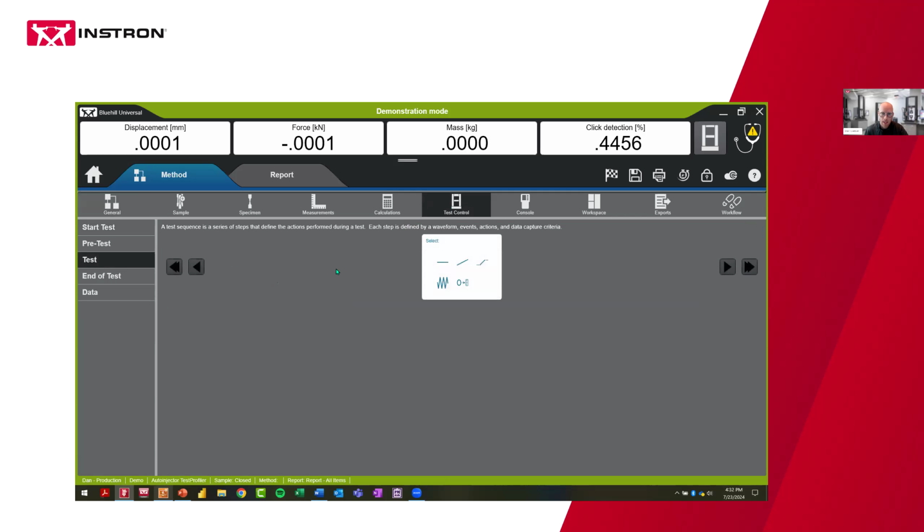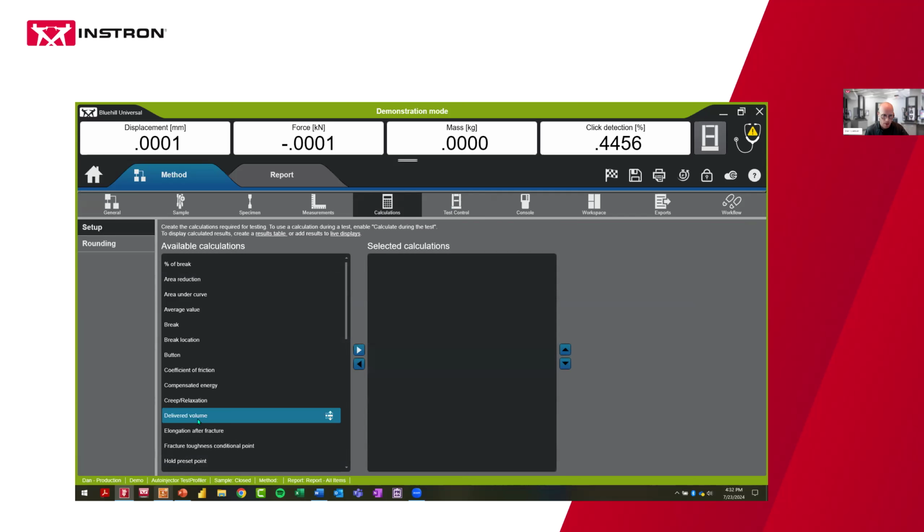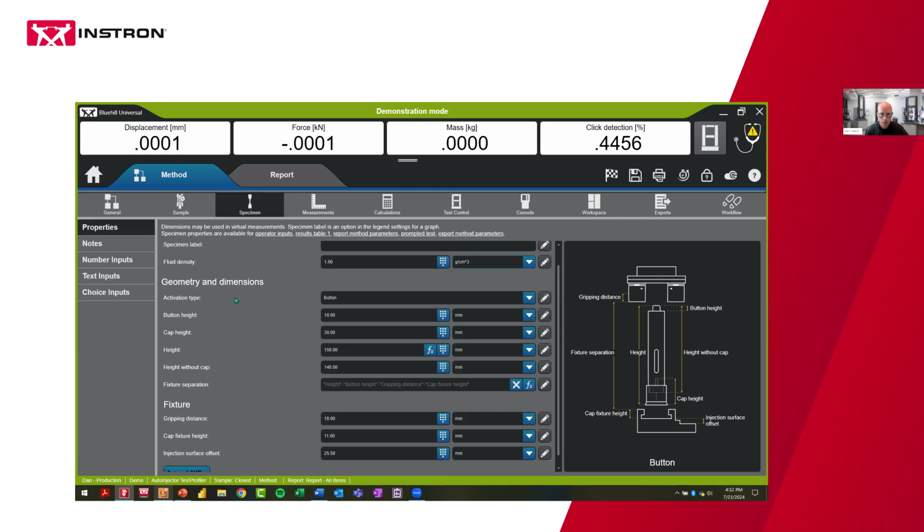And you need to do some fancy movement or some additional steps that we aren't setting up in that basic template. And then that's where you can go in and create as complicated or as simple of a test profiler routine yourself, while still having access to the calculations that we talked about with delivered volume and injection time, and then still, of course, having all of the attributes for your device captured into parameters that you can reference very easily with the test profiler test.